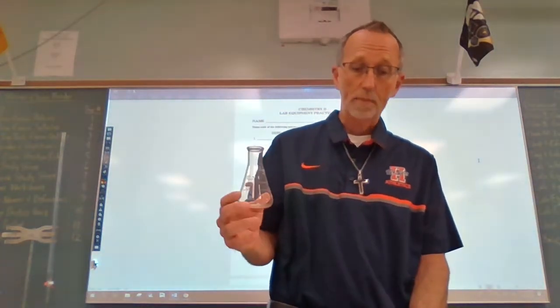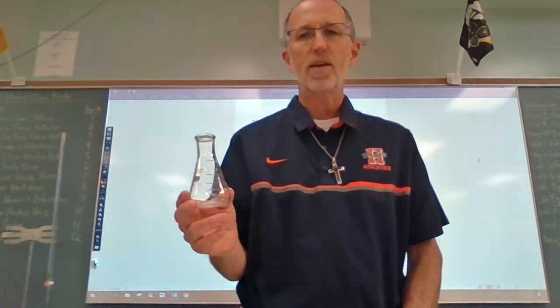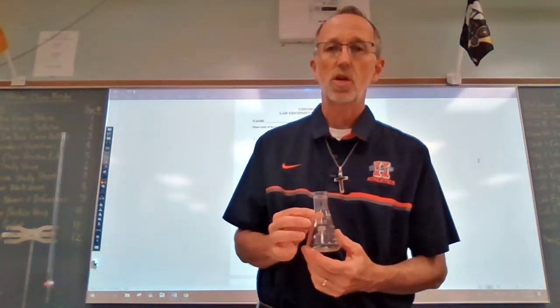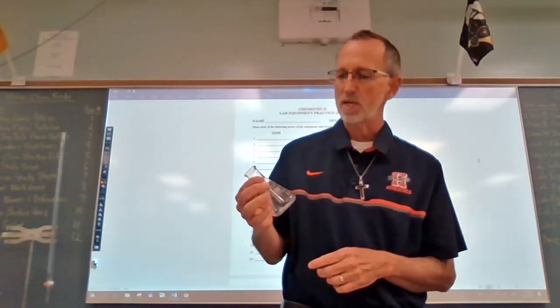Now, you'll notice on here that there are numbers, and those are volume measurements. Do we use an Erlenmeyer flask to measure volume? Well, according to this use, I don't see anything in there about that. And the answer is no. You could use this to approximate volume, but certainly not to measure volume.